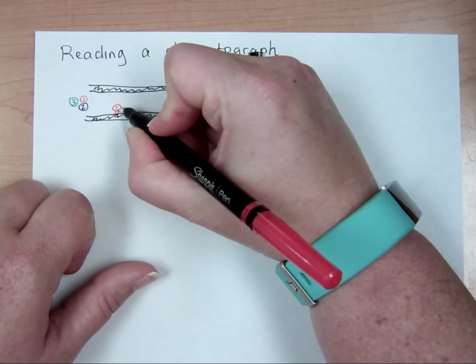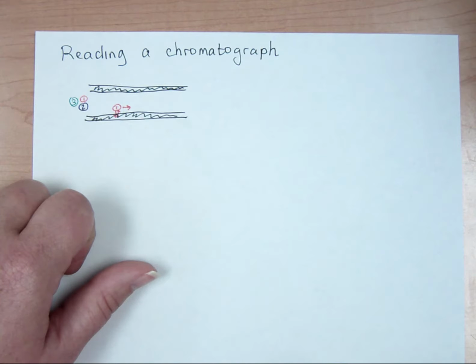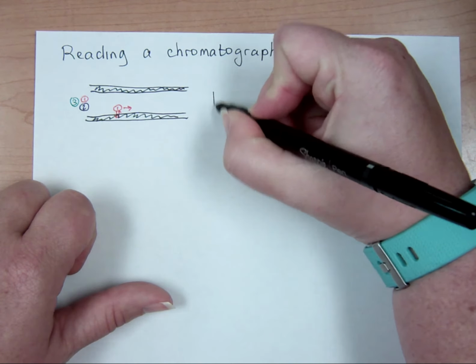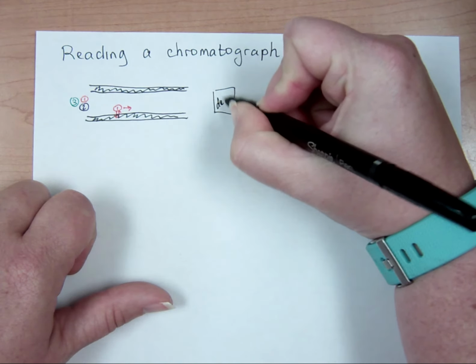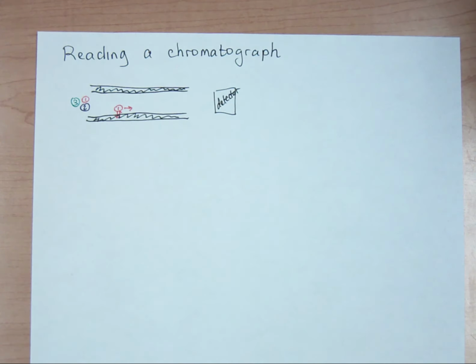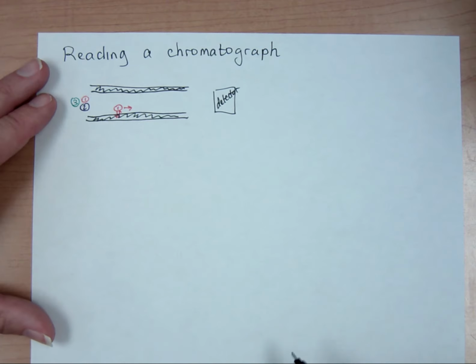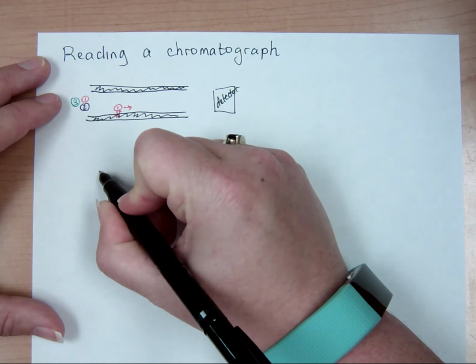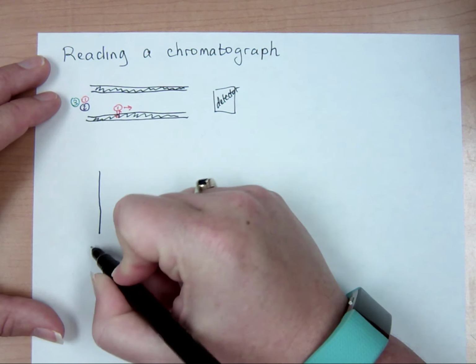Remember that when it's in the mobile phase, it's going to be moving downward, down through the column, and we can set some kind of a detector at the end to start reading and observing when the analytes each exit the column. So if we're looking at the detector, like what kind of a signal it gets, we have a 0 point in time of our point of injection.